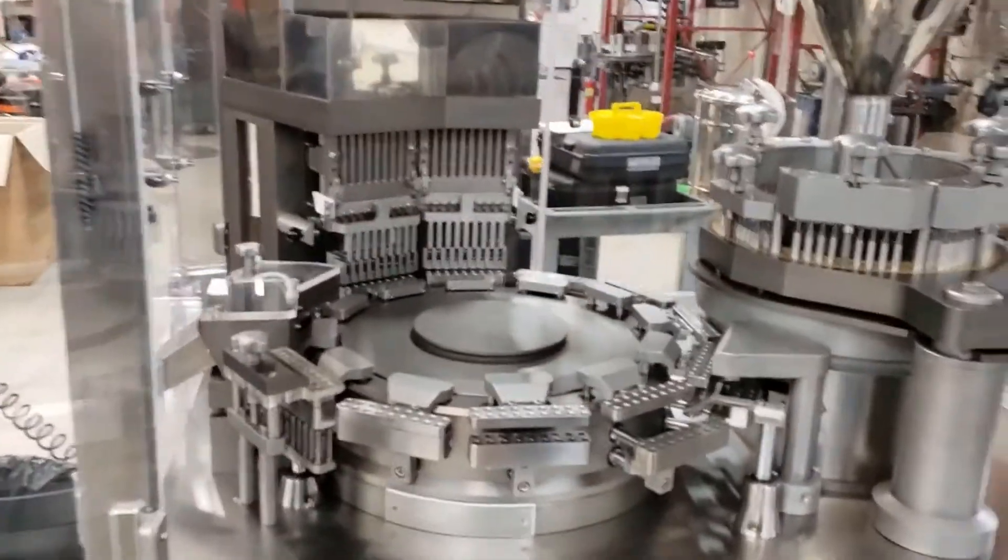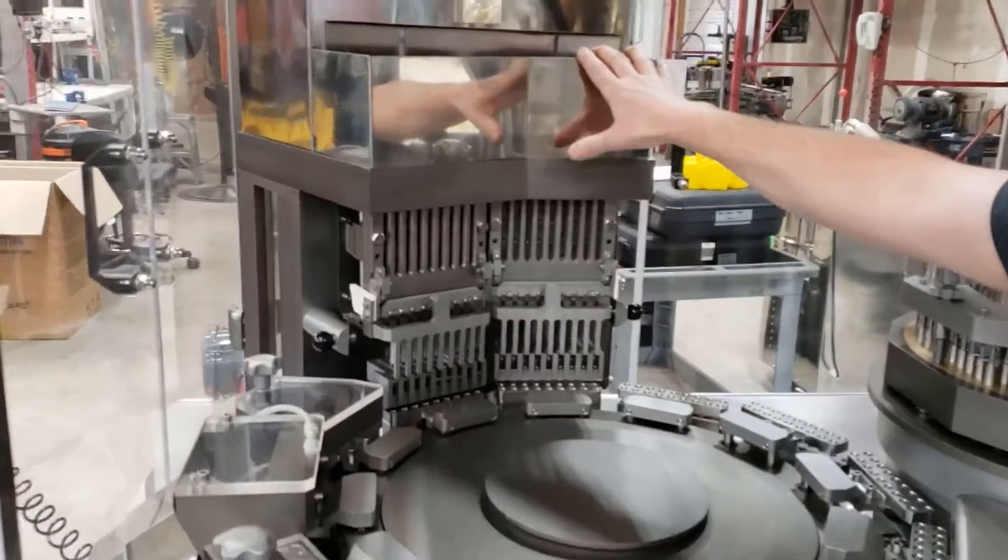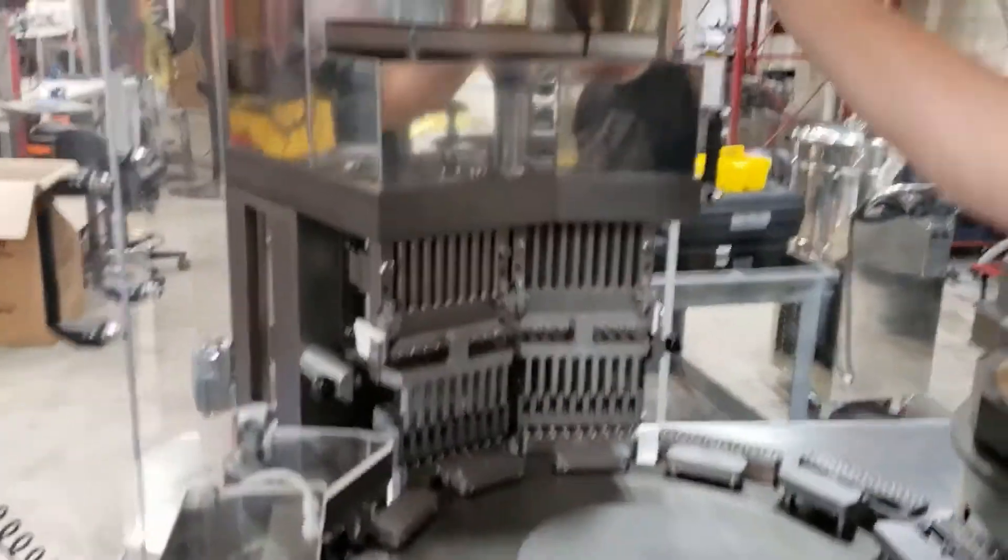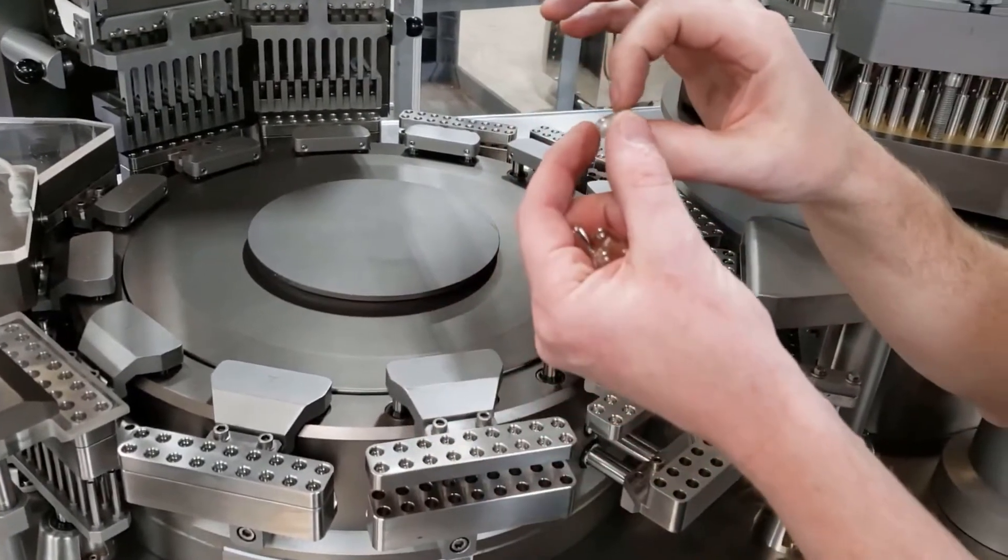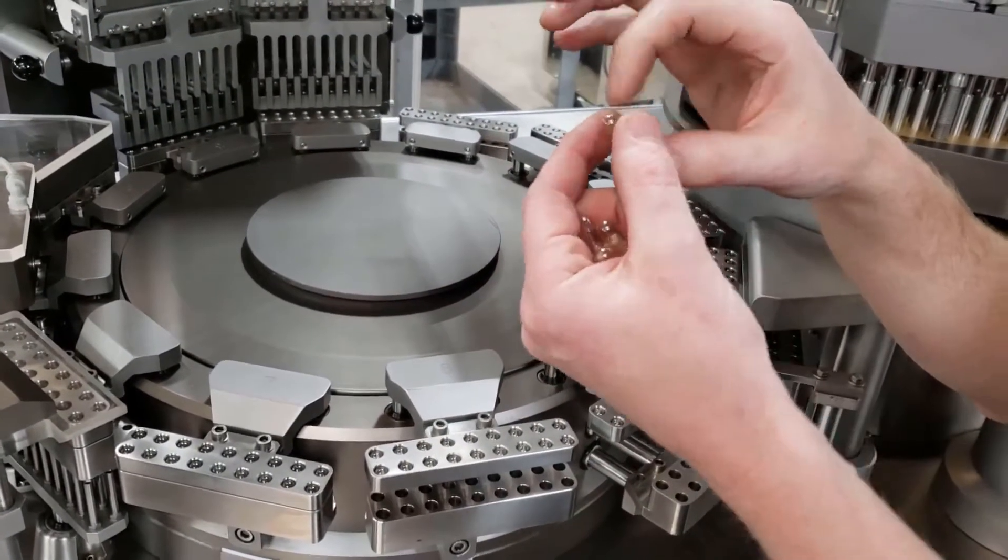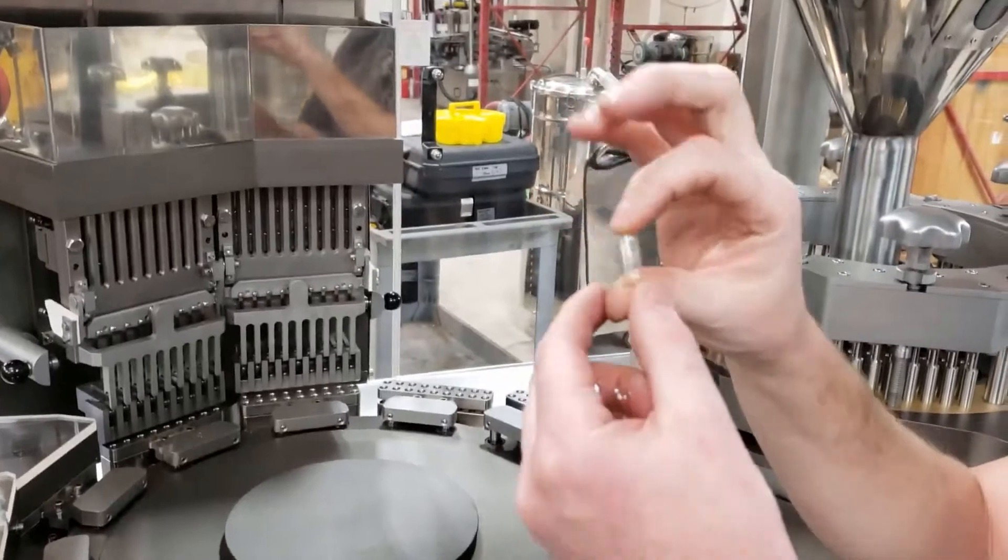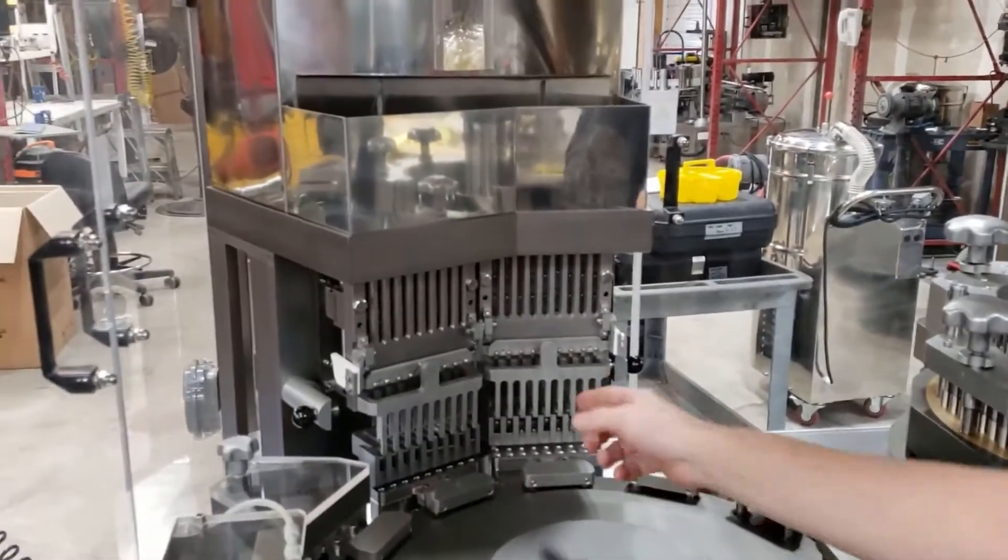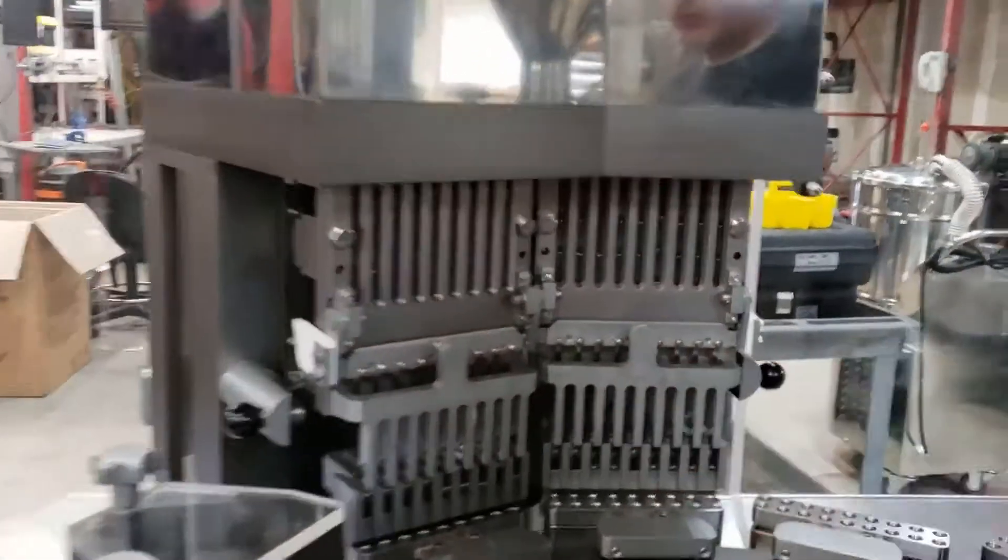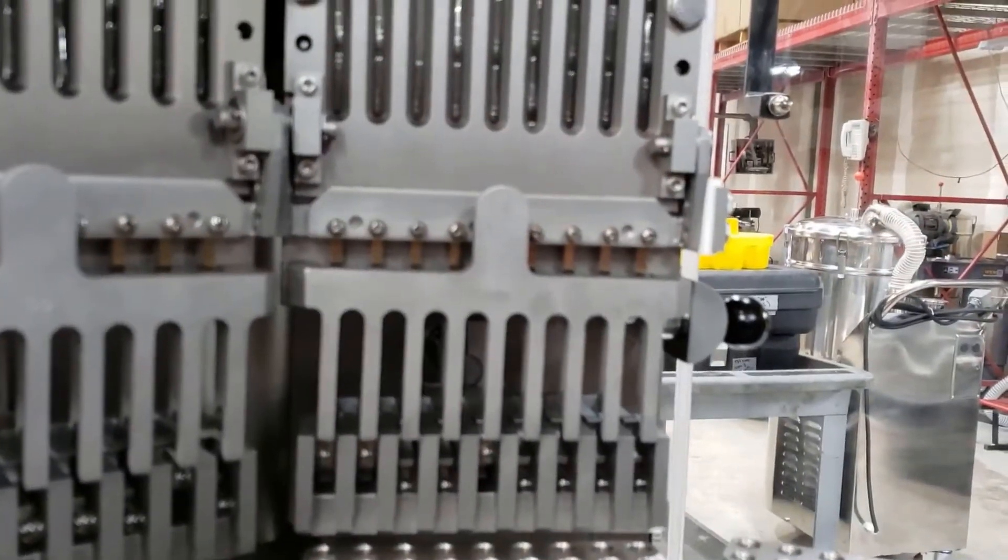We start with a capsule hopper here. So capsules, as you may or may not know, they come already together. They come in what we call pre-locked state. So they come apart really easy, but then if you bump them together, they come along. So we have different sizes of capsules. Right now we're running double zero. You see on the magazines here.